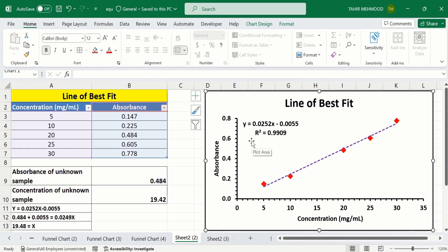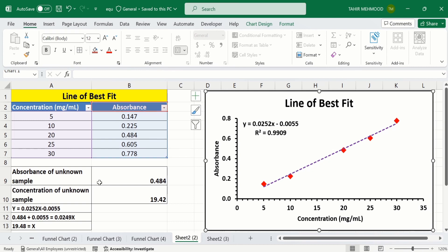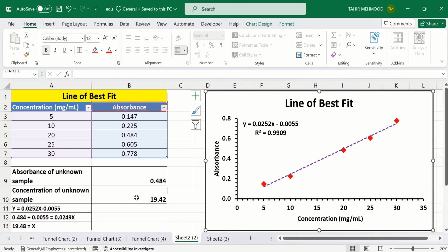Additionally, the R² value is displayed here, and I have also generated the regression equation using this data. You can observe that I have the absorbance value of the unknown sample, and using this regression equation I have calculated the concentration of the unknown sample.